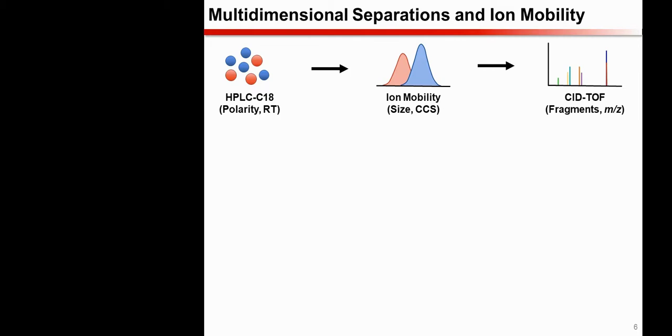And so hopefully everyone is pretty comfortable with LC-MS, but I'm just going to give a brief explanation of ion mobility spectrometry, specifically the type that we're using in our lab, for anyone who might be less familiar with that technique.